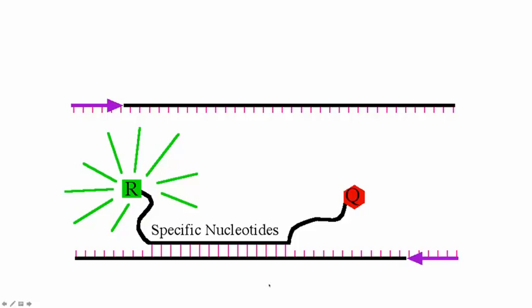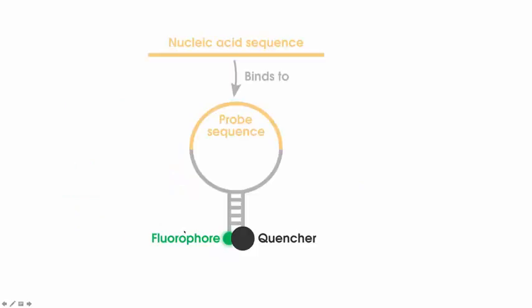So in the molecular beacons methodology, you're not actually using something which is going to degrade the DNA. Instead, the polymerase does not have a 5' to 3' exonuclease function on it. So as the primer is extended, it's simply nudging it away. And when it nudges it away, it goes back to this form right here, and the fluorophore and the quencher are close to each other, and the amount of fluorescence from the fluorophore then decreases.